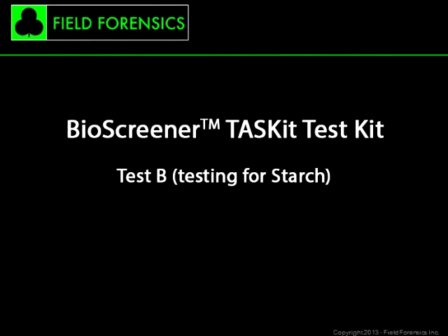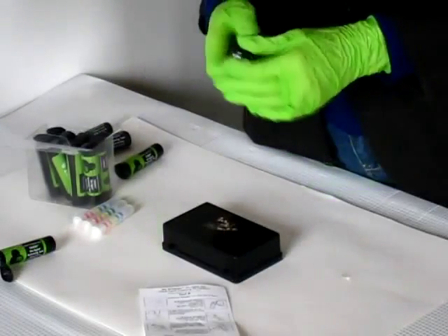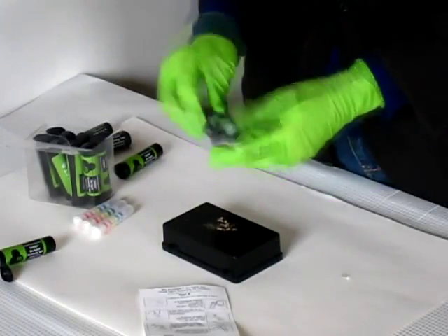The second test, Test B, is for Starch. Refer again to the instructions and repeat the steps as they were completed for Test A.